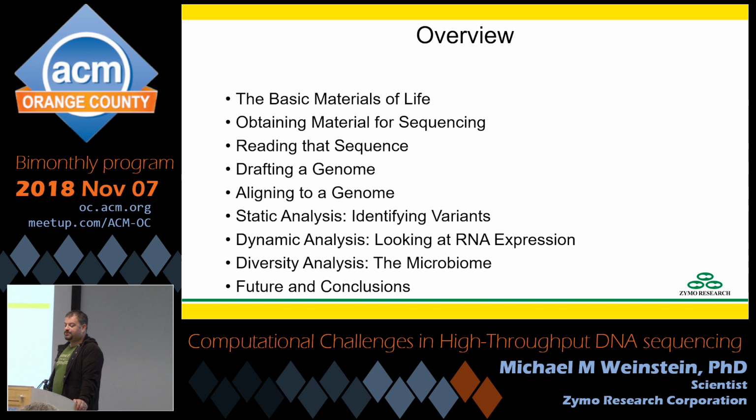And those hypotheses can be incredibly diverse. So an overview of what I'm going to speak about today. I'm going to talk about the basic materials of life and how these are used to transmit the information of life. I'm going to talk about how we obtain material for sequencing, and that's going to be very brief. Reading that sequence. So where the squishy stuff meets the actual hardware, and that hardware is pretty diverse in how it works.